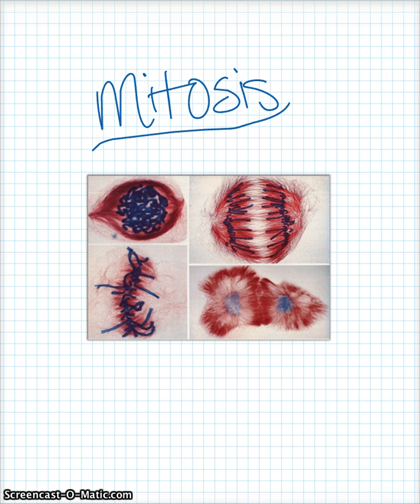So, we're going to start off with this really nice picture here. This is a really nice zoomed-in picture of some cells, and you can see everything really clearly, so it makes it easy. But we don't always have a nice zoomed-in picture. Hopefully, you can tell that this one right here is prophase, because you can see all of the chromosomes, and they're right in the center, as if the nuclear membrane had just disintegrated. You can see the chromosomes, and you can see the spindle, the nice pink spindle. So, that's really easy.